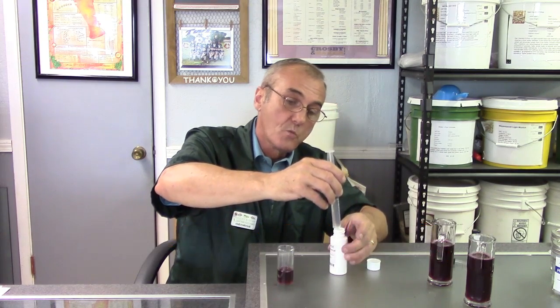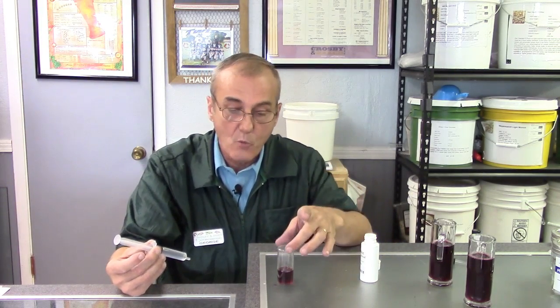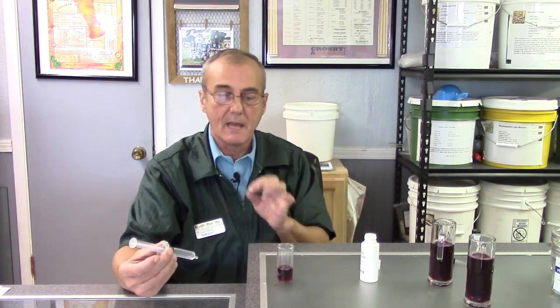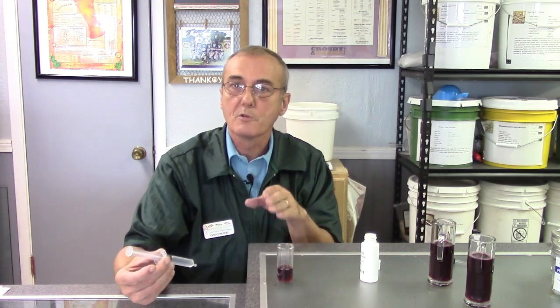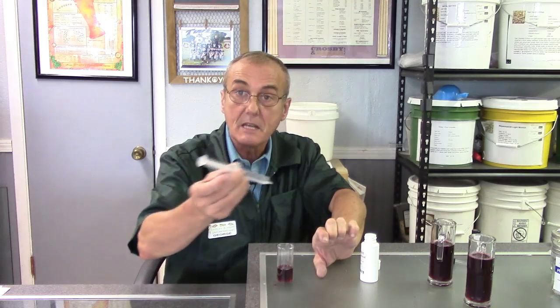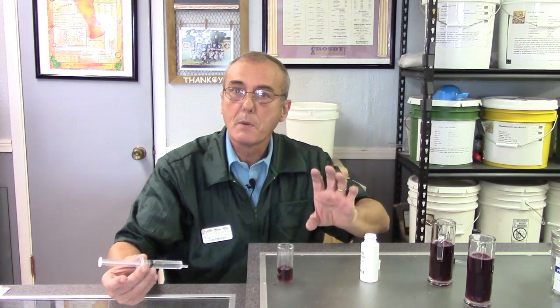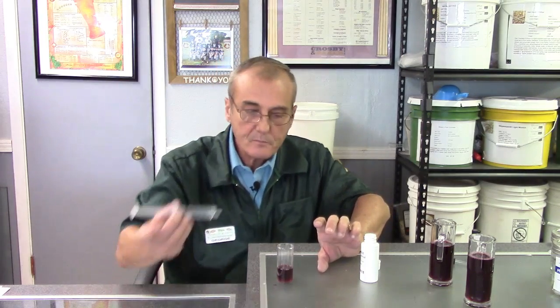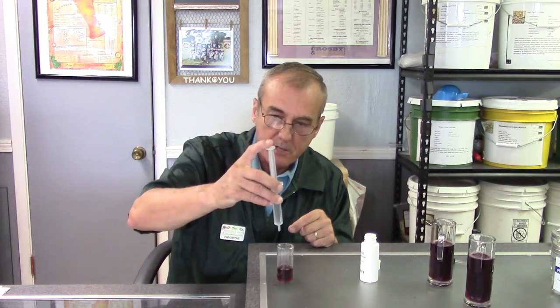We add the sodium hydroxide one cc at a time back into the wine. Red wine will turn gray, white wine will turn a purplish pink, and when you shake it, the color will disappear. You continue adding one cc at a time until the color remains permanent. For red wine we're working with gray — it's easier to describe with white wine. When I add the first cc it turns pink, I shake it and it disappears; add another cc, same thing, until eventually the color stays and we've neutralized all the acid. Let's do our first cc.